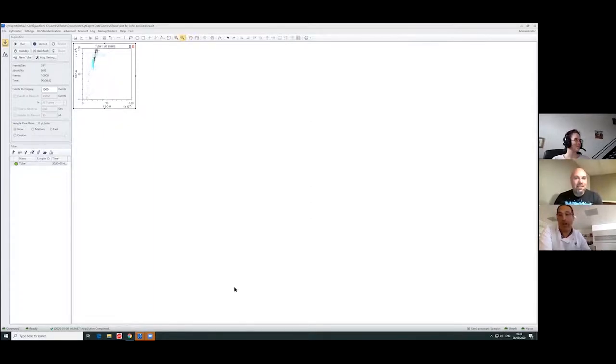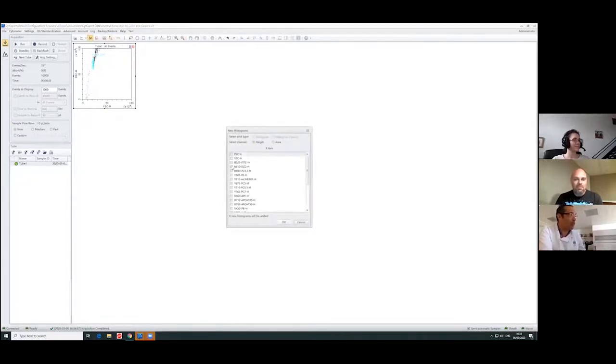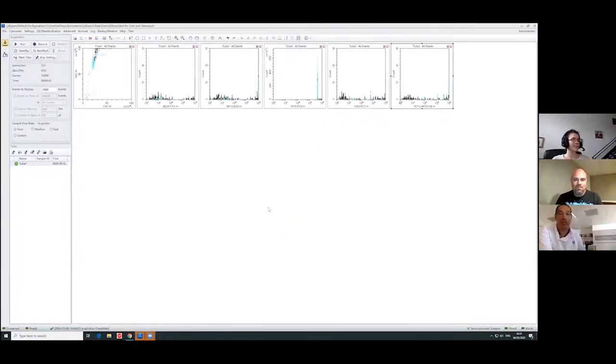So we come back again to what we have in linear scale. I can put some of these graphs to see fluorescence in FITC or ECD or different markers that I could be interested in. Some of them look like they're completely off scale. But if you remember, this is 10 to 6. This is a larger dynamic range. I'm not recording and I'm not analyzing anything. I'm just playing with the data.